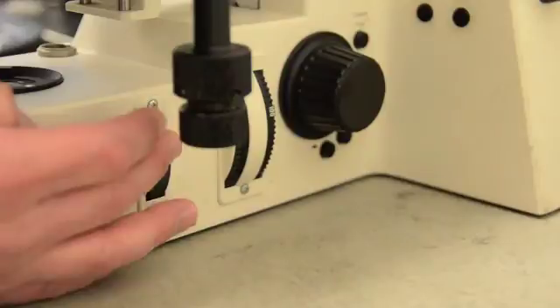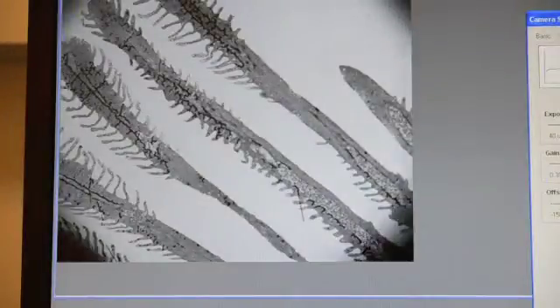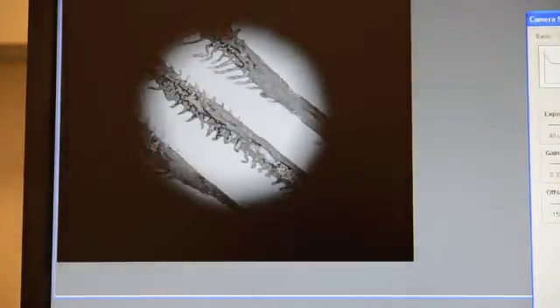Once your sample is in focus, close down the field iris diaphragm. The field of view should go dark and you may see a small cone of light consisting of the field iris diaphragm.